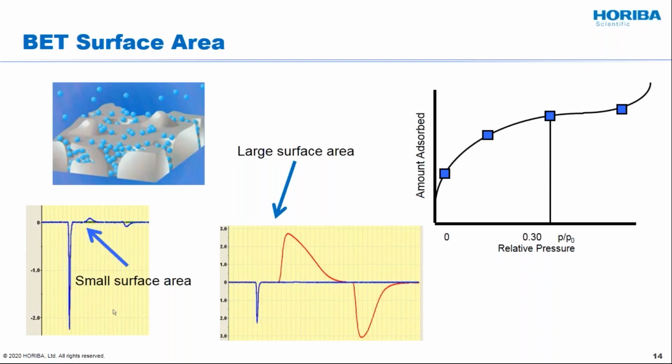to give you a much better ability to integrate what is there. And so when we go to the right side and we see the desorption, you can see a much more narrow, much more concentrated peak. And so in most cases, that would be the peak you would want to look at, because it happens so much more quickly. You have much more area under the peak happening very quickly, so it's much easier to integrate.